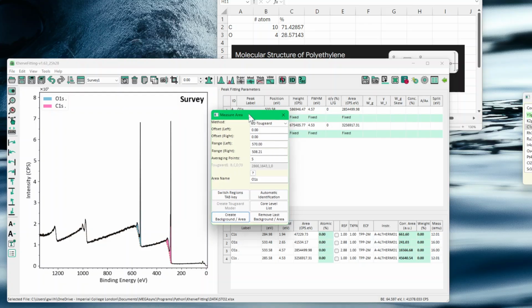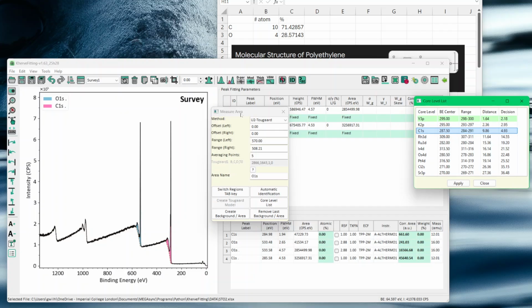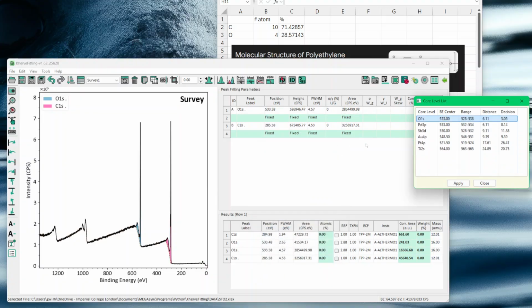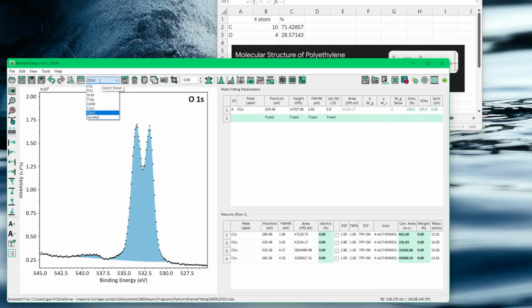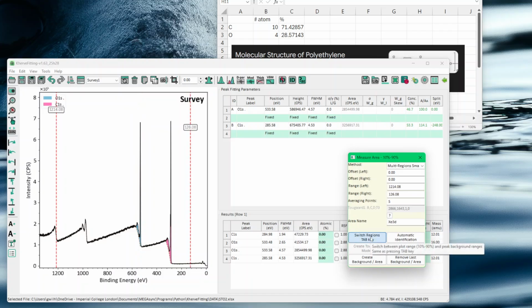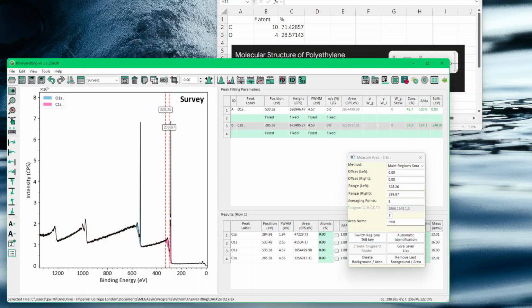Now, the other thing that is available using this measure area is we can obviously switch in between different regions like so. Let me just redo it again, because as I said, maybe it wasn't done right. Yeah, okay. So now we have our vertical line, so we can go in between like this using the regions. That's also possible. That's maybe easier to see if I create a new one.